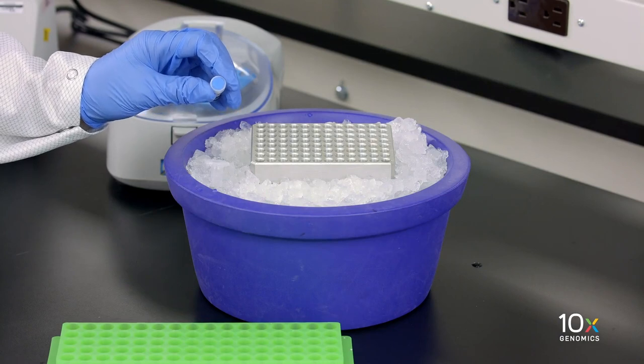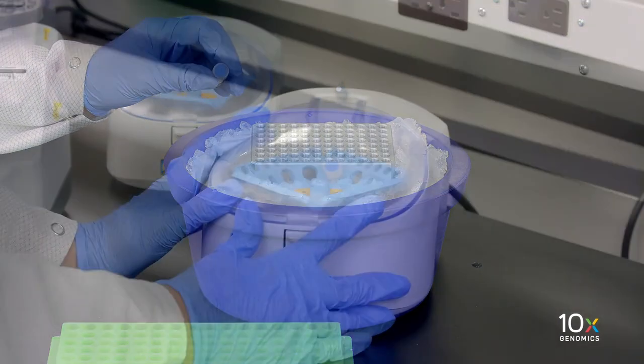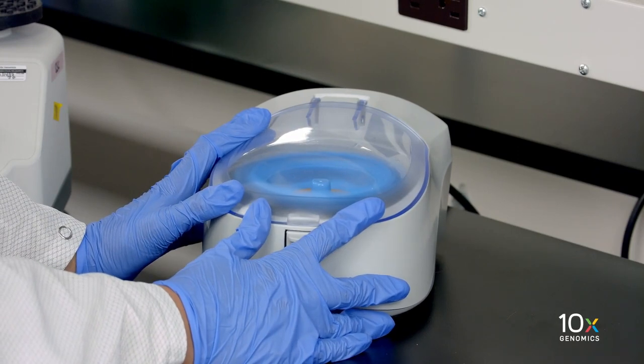Finally, we have our RT enzyme C, which is kept on ice. Briefly spin down before adding to the master mix.